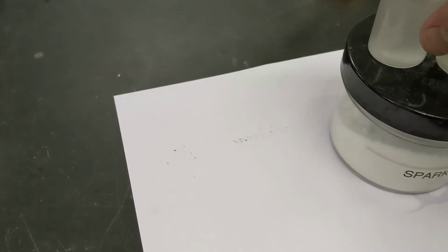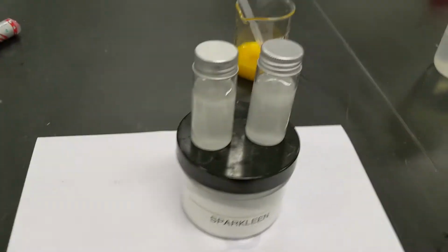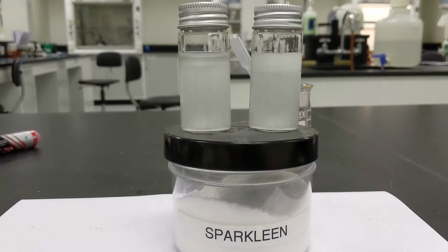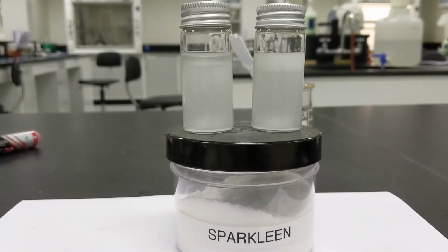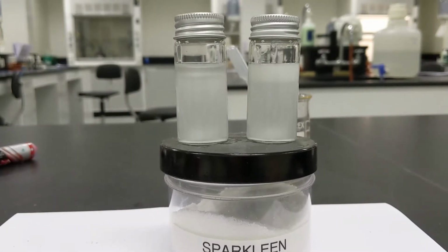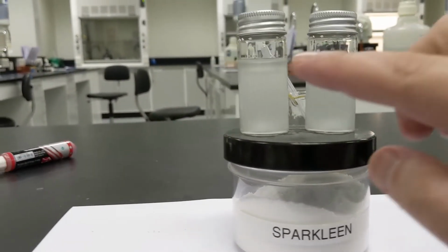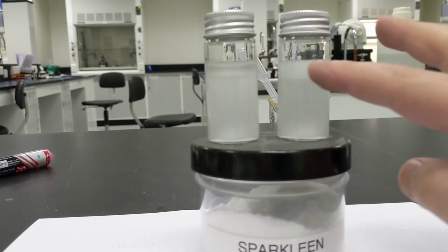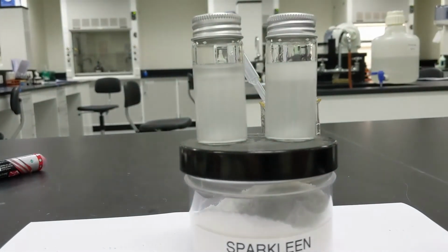Okay, so I've left them for long enough. I'm not going to wait forever, but according to my phone, that was only about a minute or so, and you can see that they're starting to separate out. So within 60 seconds, they are beginning to separate. You can see the layer here and the layer here. I think I shook this one up a little bit more, but you can still see 2 distinct layers.